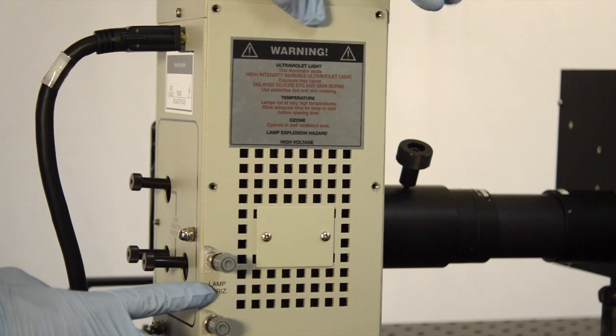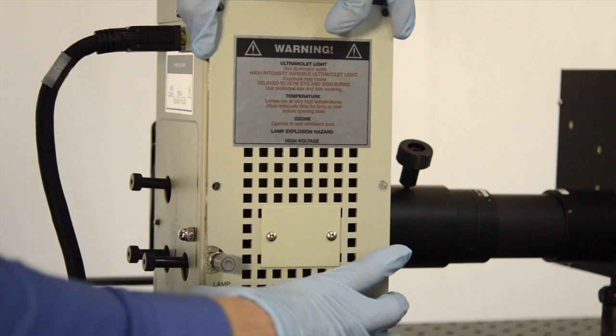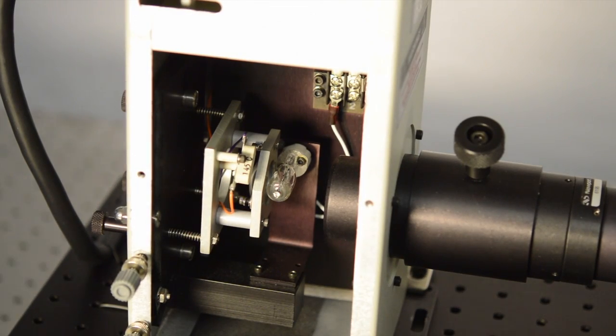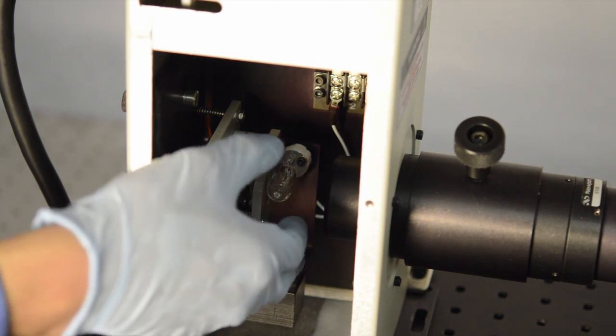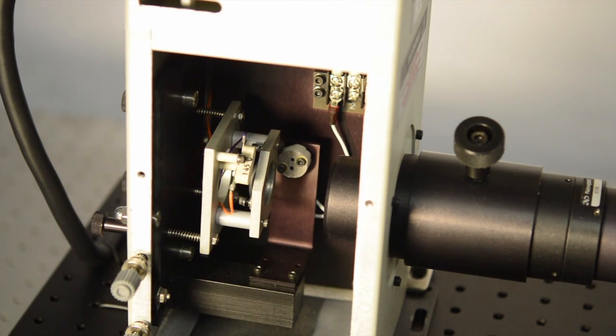After the six thumb screws are removed, you can carefully remove the side panel of this lamp housing. So this is our 250 watt quartz lamp that's reached the end of its lifetime. We're going to remove it from the lamp housing. Very carefully pull it from the socket adapter, it should come out easily. We're going to set that aside and then get our new lamp.